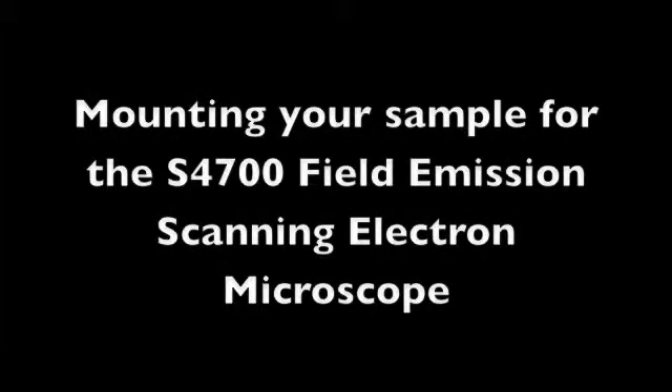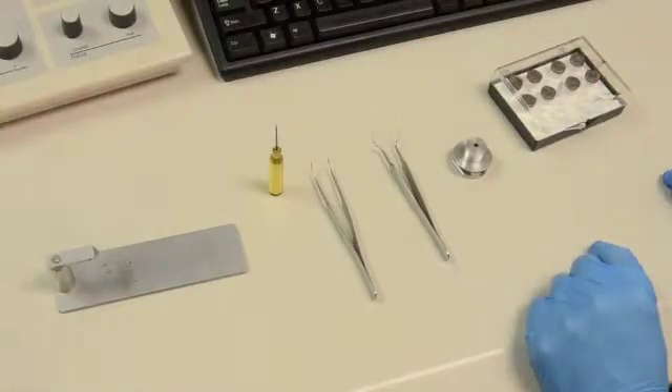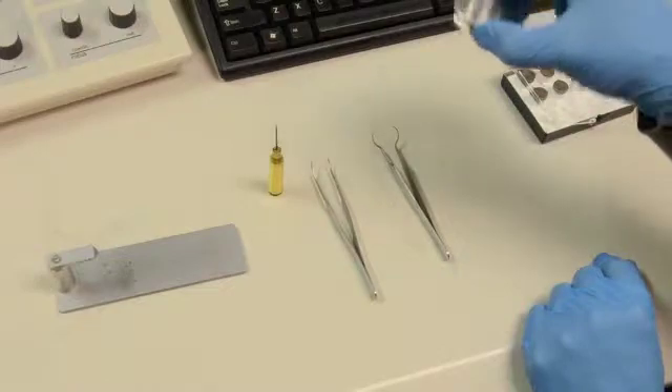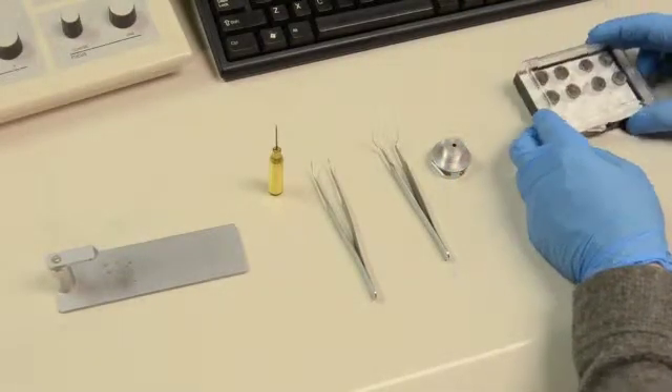Mounting your sample for the S4700 Field Emission SEM. You must mount your sample into the correct holder and check the sample height. To do this, assemble the adjustable sample holder for your specific sample.